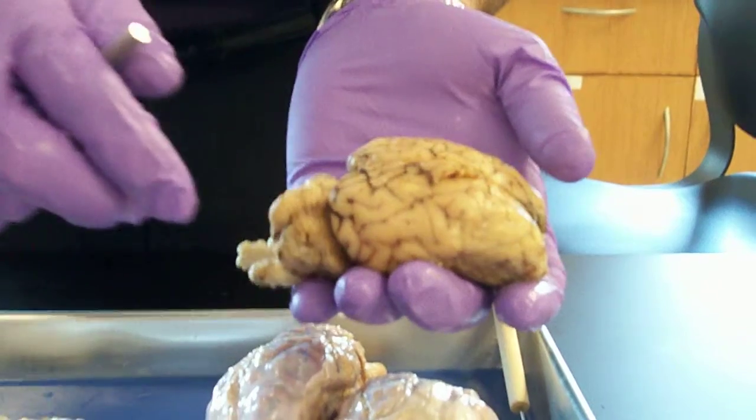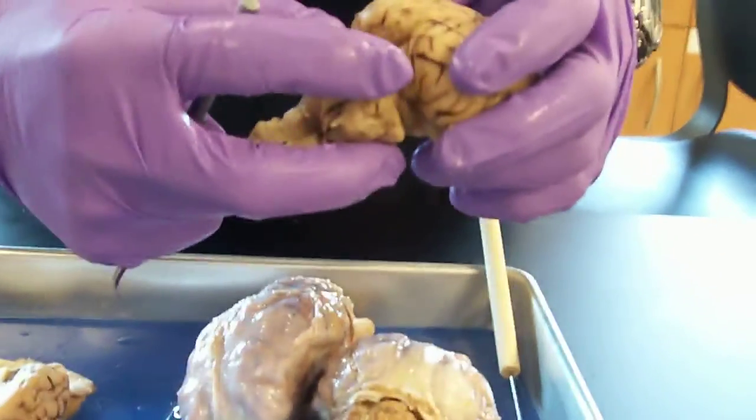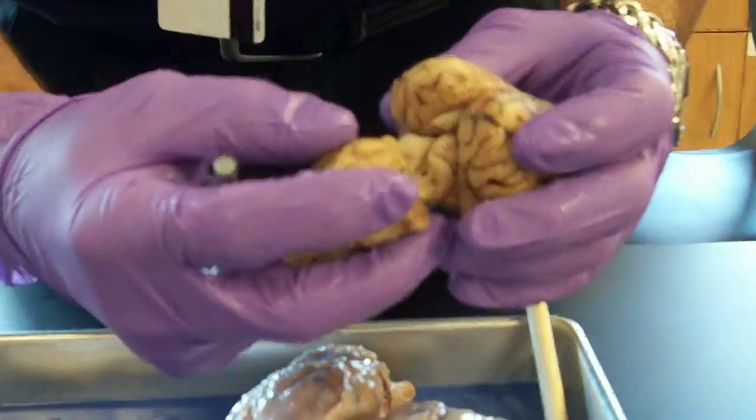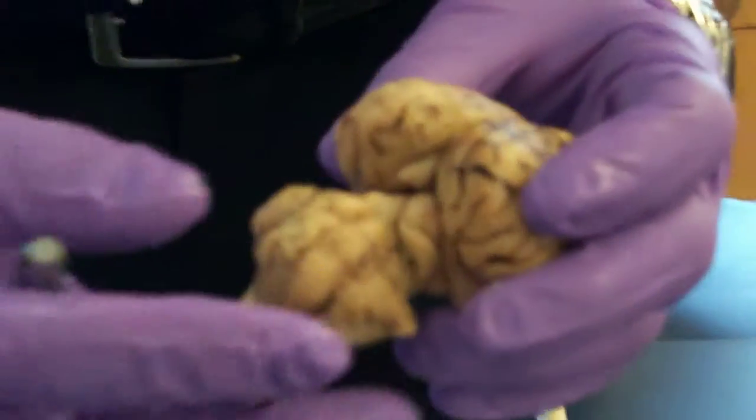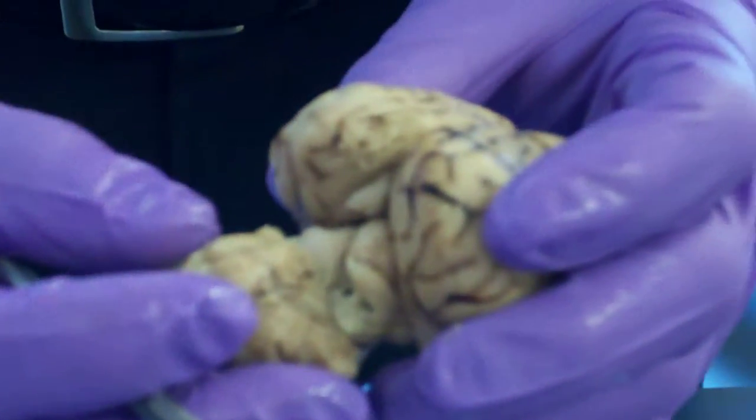It's next on the list. If we pull apart the cerebrum and the cerebellum, you see those little bumps in there. That's the midbrain. Each of the 4 bumps makes up the corpora quadrigemini.